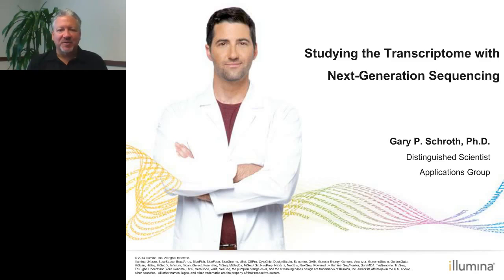My name is Gary Schroth. I'm a distinguished scientist at Illumina. I work in our R&D group in a team we call the Applications Group. And today I'm going to talk about studying the transcriptome with next-generation sequencing.